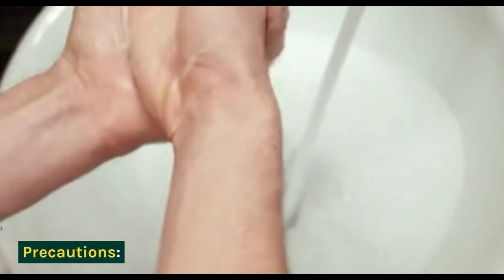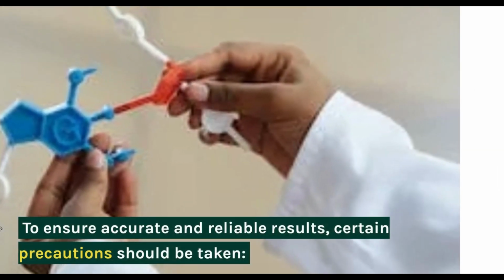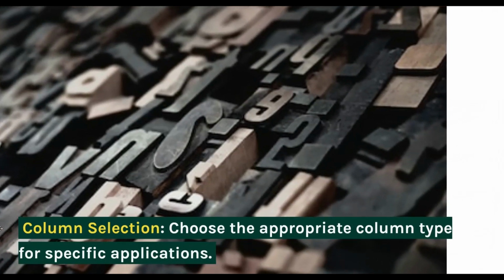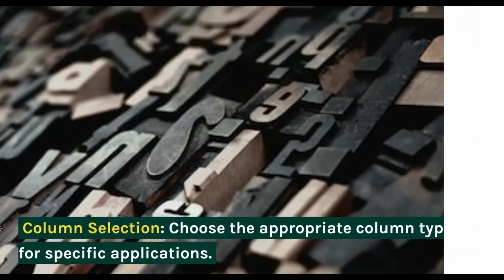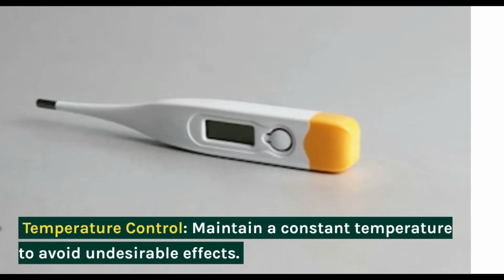Precautions. To ensure accurate and reliable results, certain precautions should be taken. Column selection. Choose the appropriate column type for specific applications. Temperature control. Maintain a constant temperature to avoid undesirable effects.